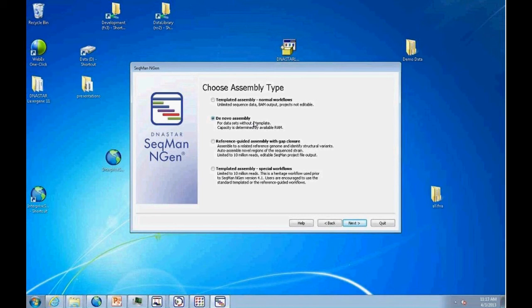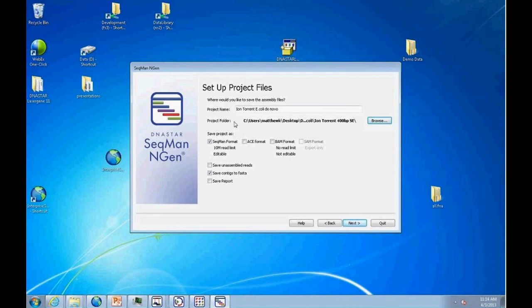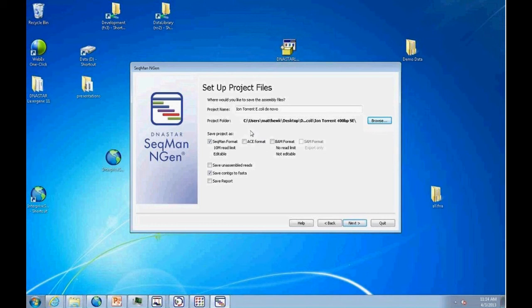There are read options for trimming. Quality end trimming is on by default. Vector and adapter scans are also available — with de novo assemblies it's very common to have leftover linkers, adapters, or primers on reads, which can inhibit assembly. For de novo transcriptome, there are often cDNA linker sequences. A common approach is to do a pilot assembly on a small subset — say 100,000 reads — identify any lingering linker sequence at read ends, define it as a FASTA file, and set up a vector trim to remove it efficiently before the full assembly.